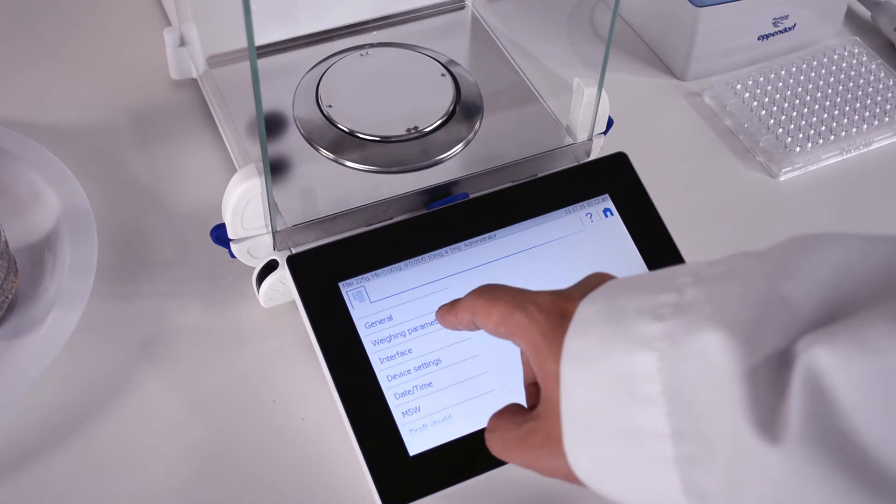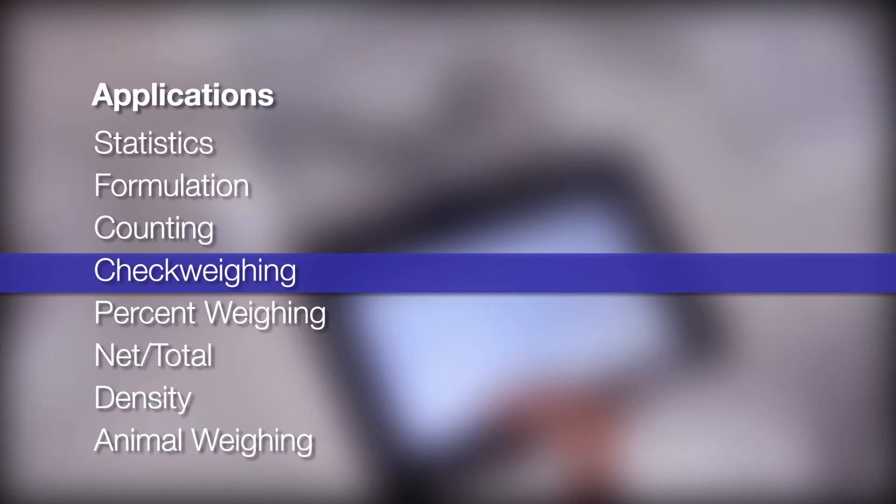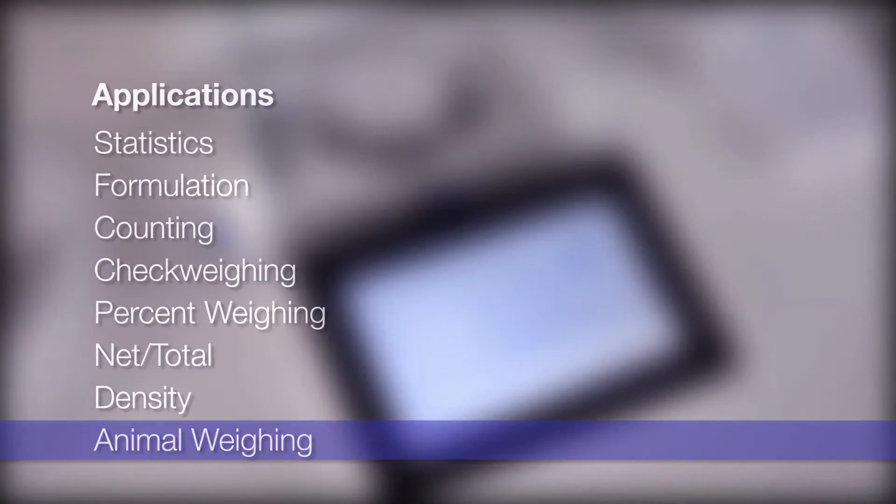All the applications of the balance are available just by swiping to the right and tapping on the applications, such as statistics, formulation, counting, check weighing, percent weighing, net total, density, and animal weighing.